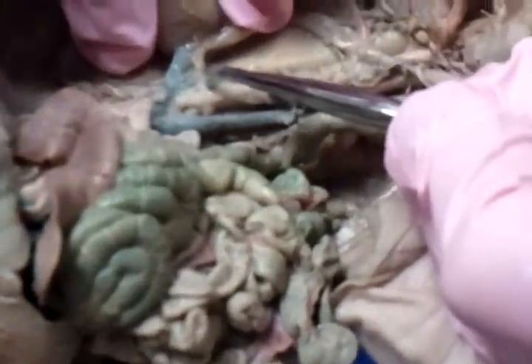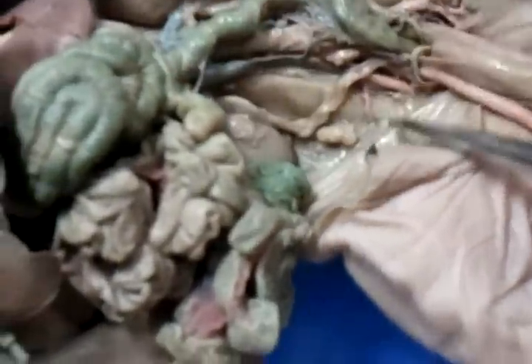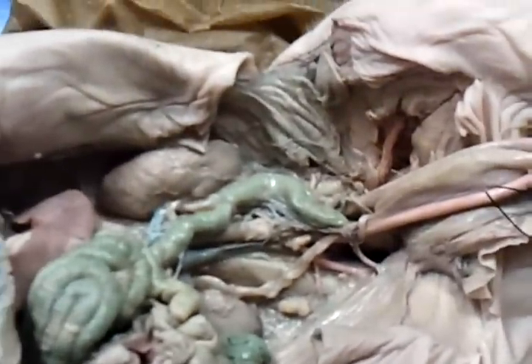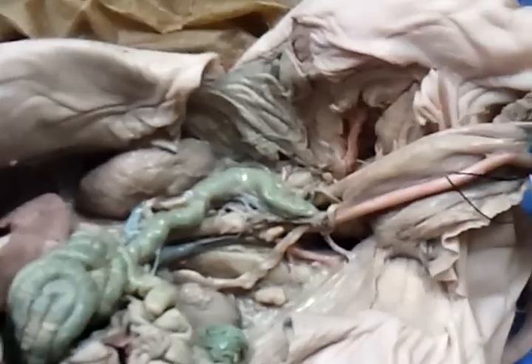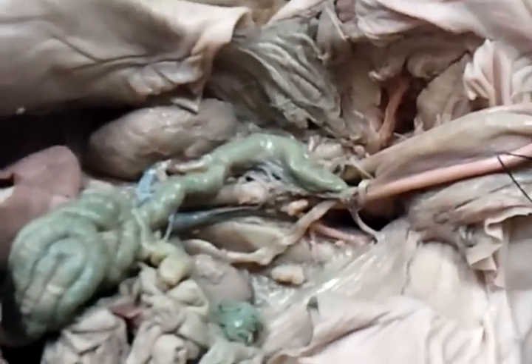All right? Going further down after the renals, the next thing we should find are the gonadals. These are a little difficult. Mine was severed. Yeah, hers is severed. But when you find them, you had a what? Female? Male. You had a male? Yeah, they're going to be hard, but they'll be really thin vessels going to the ovaries. It's easier to see in females. In the males, the testes either can be partly descended or all the way descended. Little thin vessels going to serve the ovaries in the female.